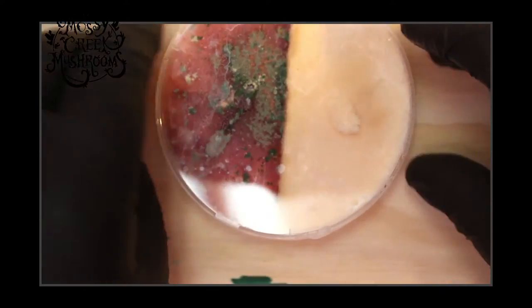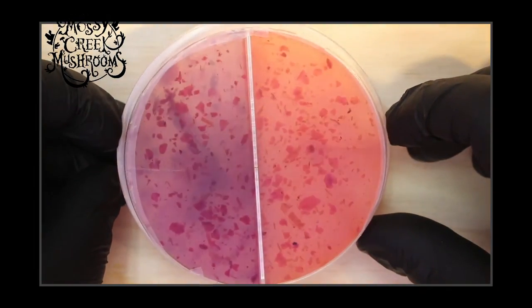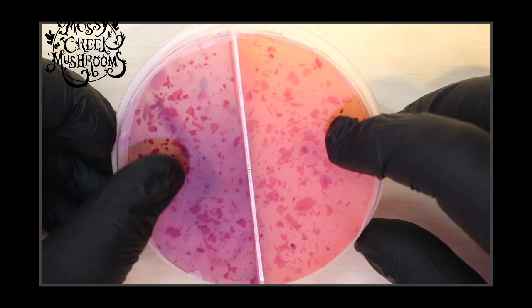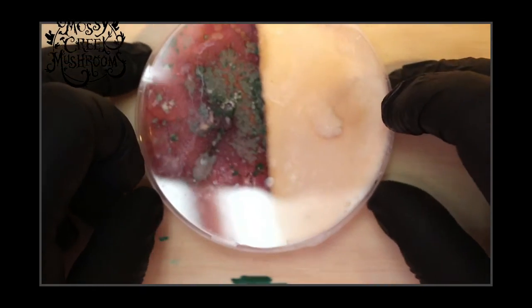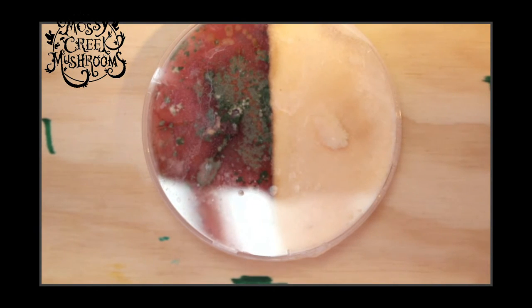Today I'm going to be working with the smaller dishes. Here's chicken of the woods — there's your nice moldy plate. I'm going to carefully flip this over. You can see this is the clean side, this is the moldy side. You can even see where the mold is. This side's lighter — that's why I love food coloring. It shows you the contamination so easily. No professional uses food coloring? That's BS. I do this for a living, I use food coloring. I am the proof that those people are wrong.